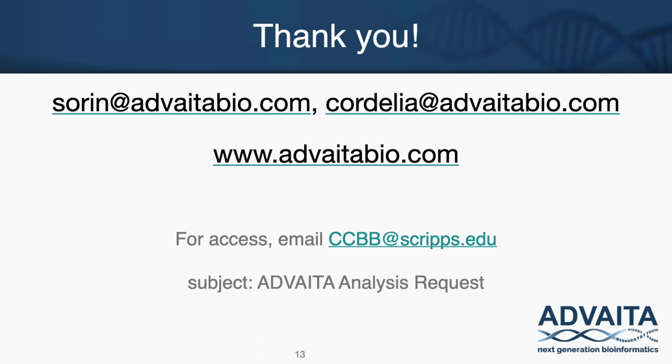I do not know what a GMT is. Are those transcripts? GMT, like differentially expressed genes? Aishwarya, can you clarify what that is, and then we'll answer this question?